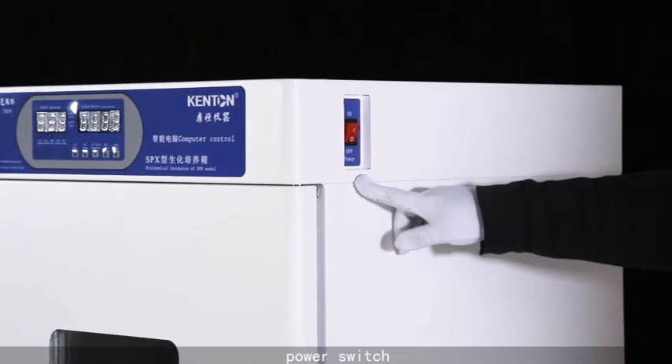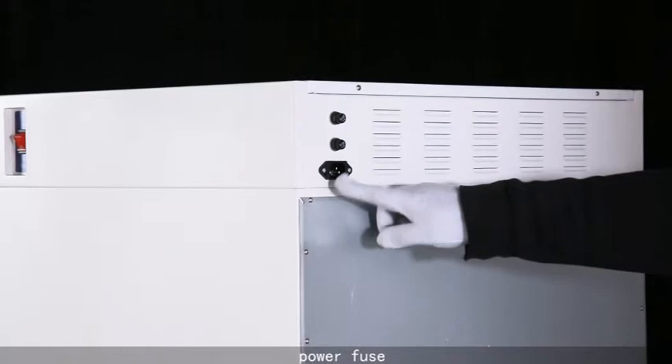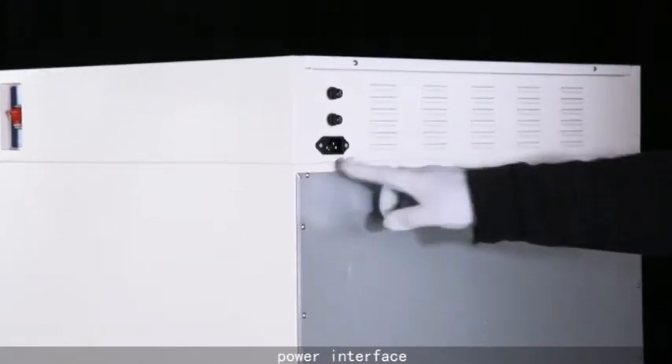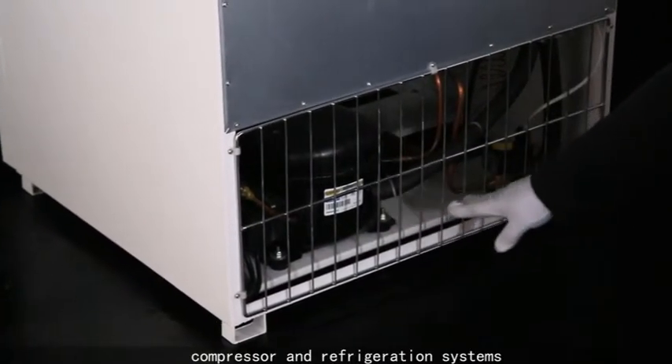Power switch, power fuse, power interface, compressor and refrigeration systems.